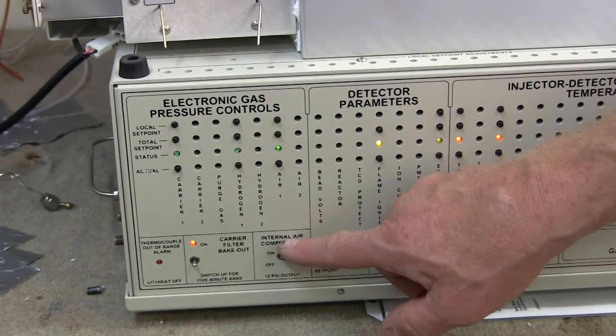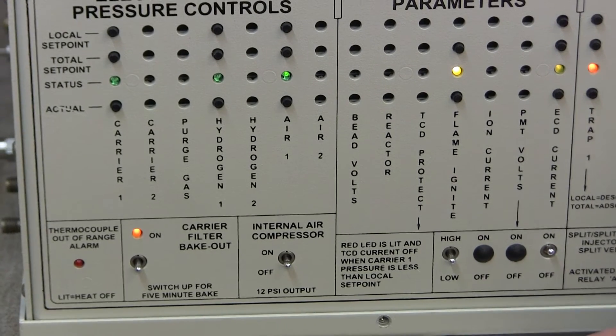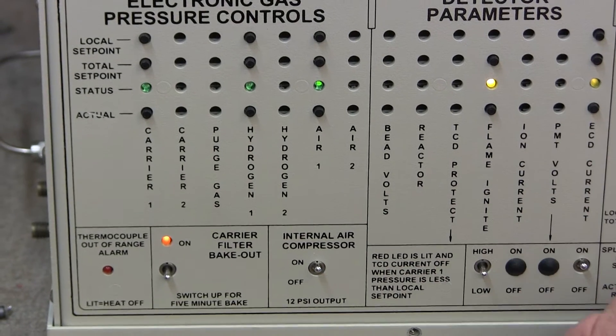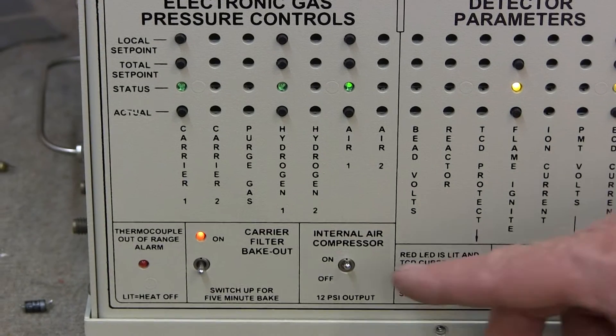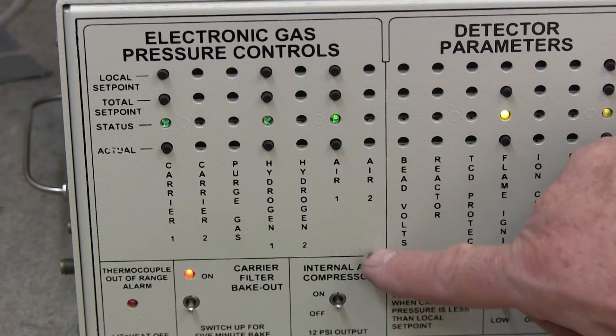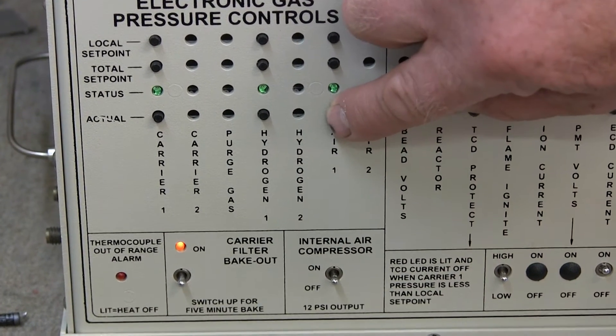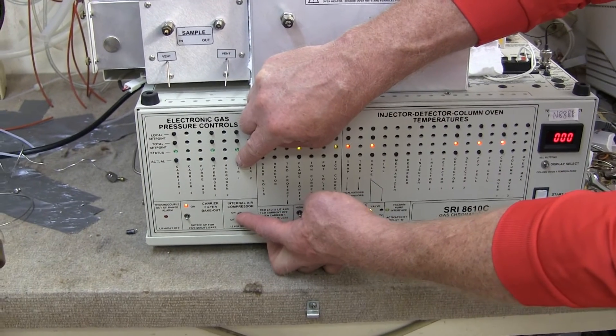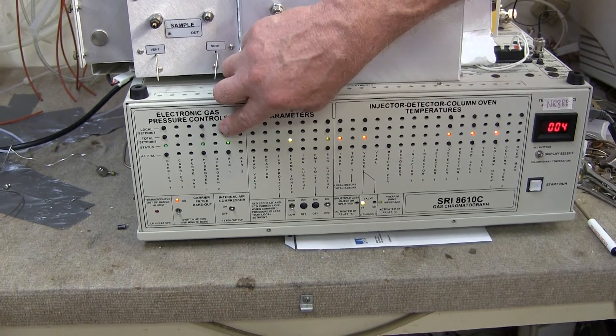This switch here turns on the built-in air compressor. Not all of our GCs have a built-in air compressor, it's an option, but many of them have this. This provides air to the flame ionization detector or some other detectors that also use air. You can't hear the air compressor running, but this turns it off or turns it on. If you turn the air compressor off, then the air pressure actual will bleed down to zero because there's no air to supply it. When you turn the internal air compressor on, then the pressure goes back up to whatever the set point is.